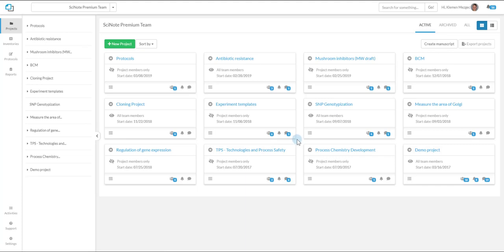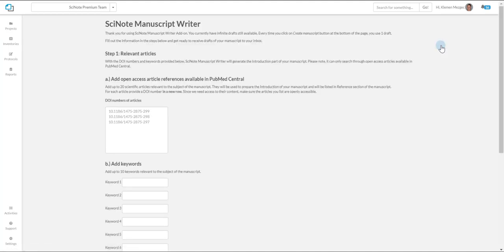To start with generating a draft of your scientific manuscript, click on the Create Manuscript button on the Projects Dashboard.